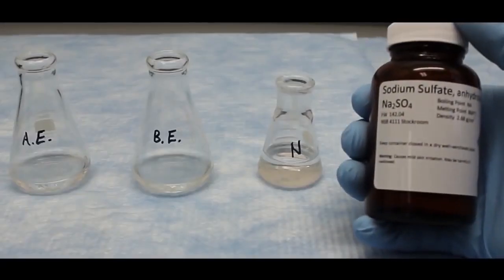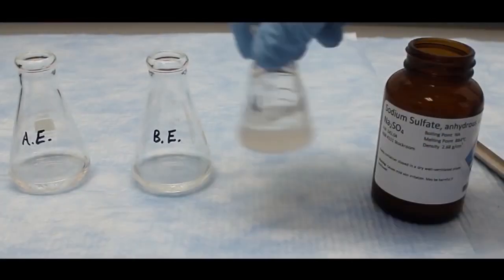I'm going to add anhydrous sodium sulfate to the neutral DCM layer to absorb any water that may be present. You can tell enough has been added when you can swirl it around and it's not all completely clumped together. I will set this aside for now.